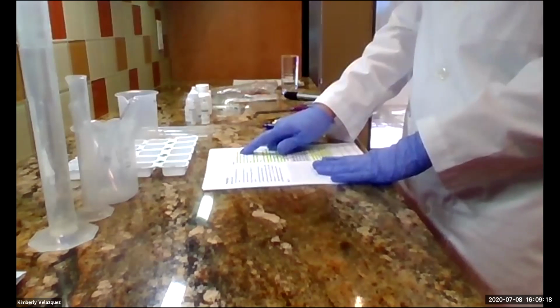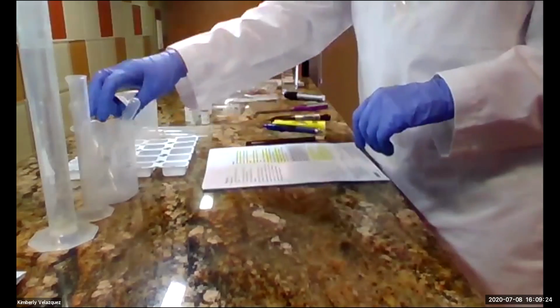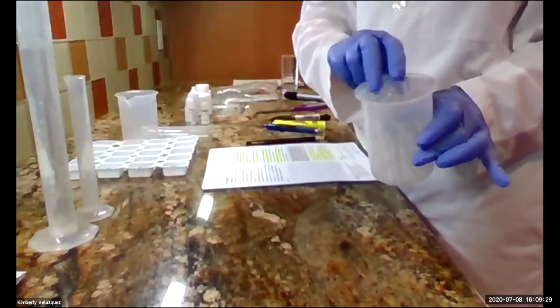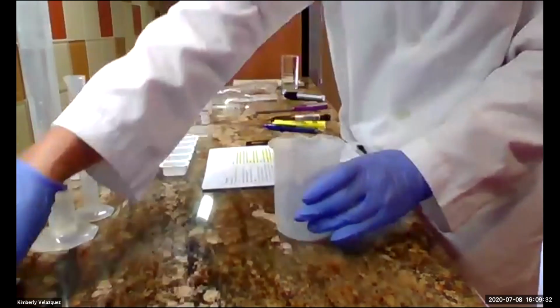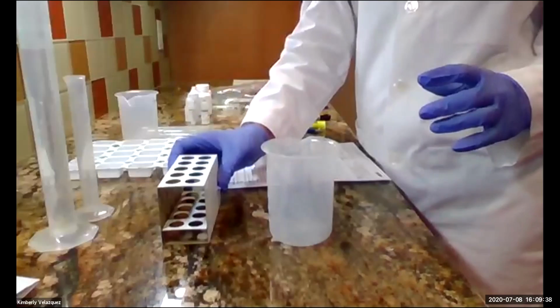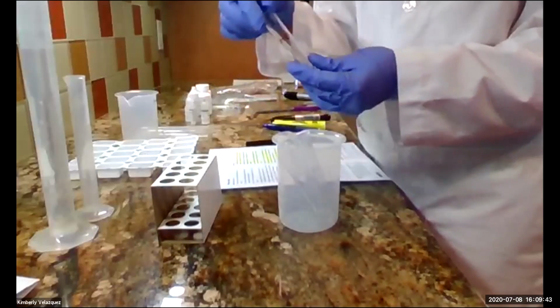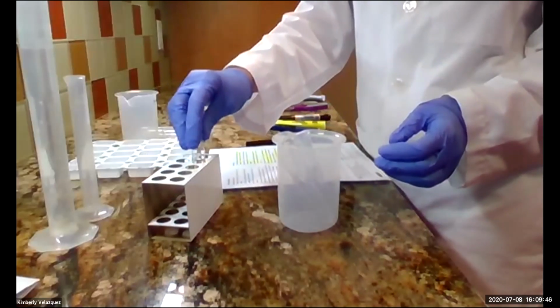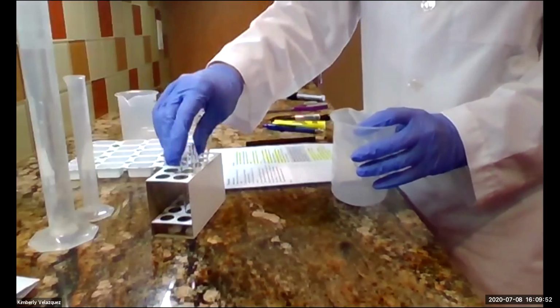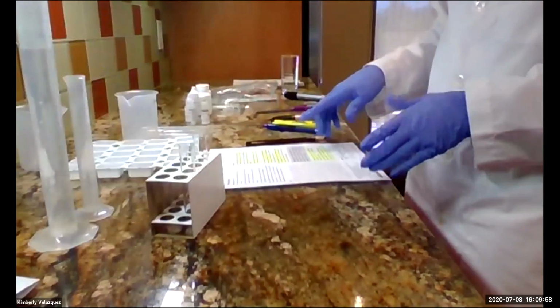Now, the first thing it asks you to do is use a grease pencil to label 2 test tubes. So you're going to go into your general bag and pull out all 5 of the test tubes. What I like to do is initially keep them in a beaker, but eventually you're going to be putting them into the test tube rack, which is this cardboard thing, which actually seems to work pretty well for cardboard. Okay, so you're going to take 2 test tubes. One you're going to label HCl for hydrochloric acid, and one you're going to label NaOH for sodium hydroxide. And you'll put those in your test tube rack. There are 3 other test tubes that you're going to be labeling for activity 2, but you don't need to do that yet.